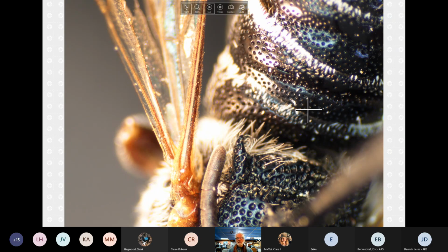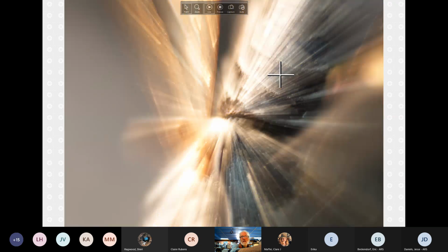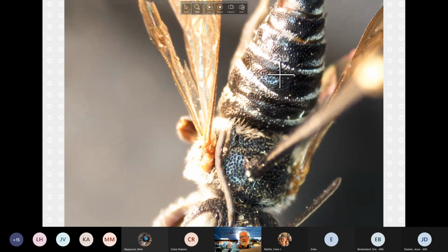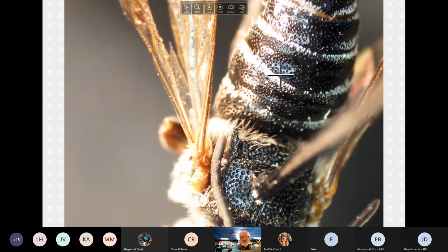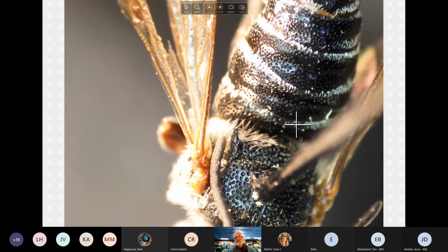And this is a problem with guides, right? You want it to be pristine. So we'll look at that again. But there's the fovea, okay? And so here's the two grooves we're going to back out that are important in sayi versus octodentata, and generally important to species.